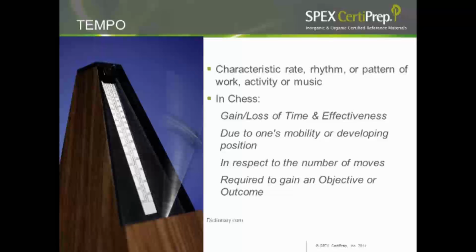If we look at a typical QuEChERS experiment, these are all the possible steps you have in a QuEChERS experiment. You have your initial sample prep. Now, some laboratories are very lucky and they receive pre-homogenized samples. They don't do really any sample prep. They take their sample and they go on to the next step. Some labs actually get agricultural products in their raw form and have to do some sort of sample treatment or processing or homogenization, grinding on that sample, and that can take a lot of time, a lot of effort, and a lot of money. You weigh your sample, you add your solvent.